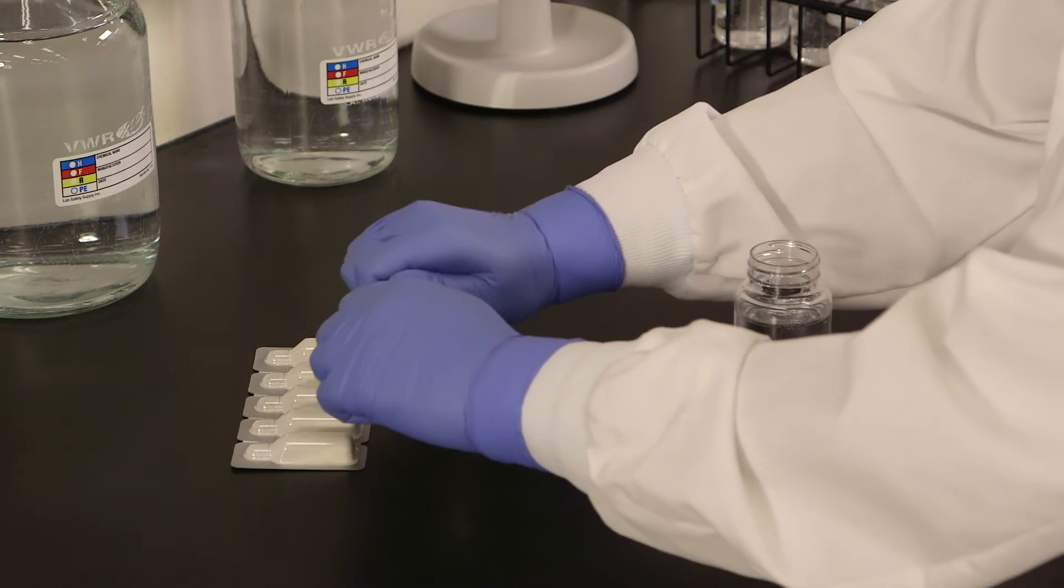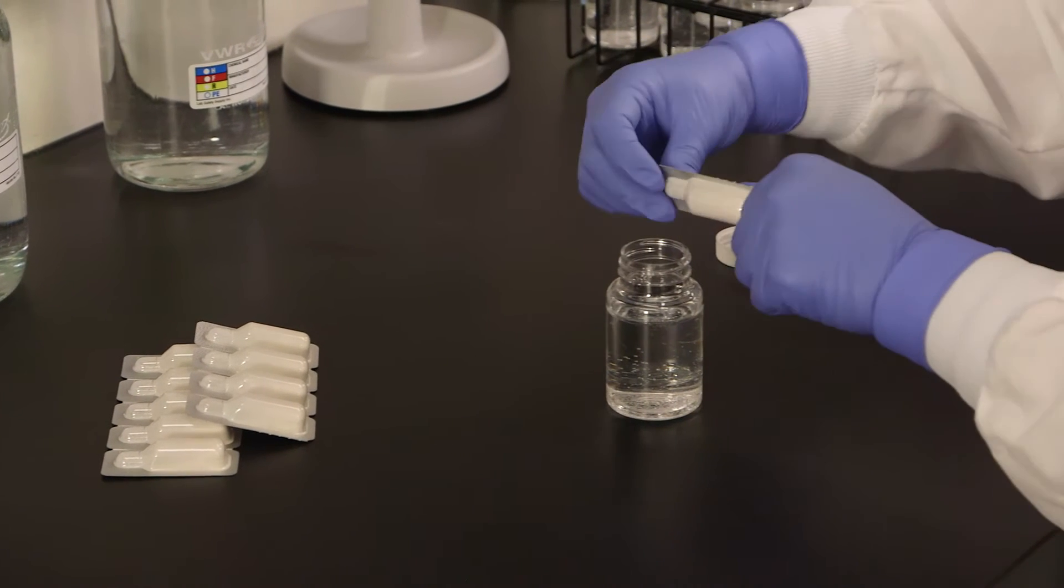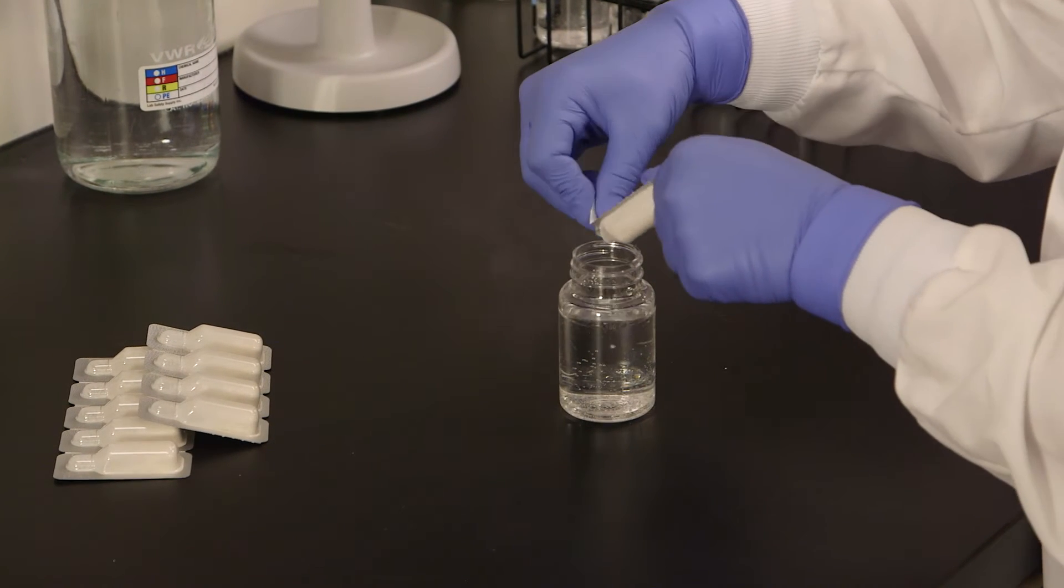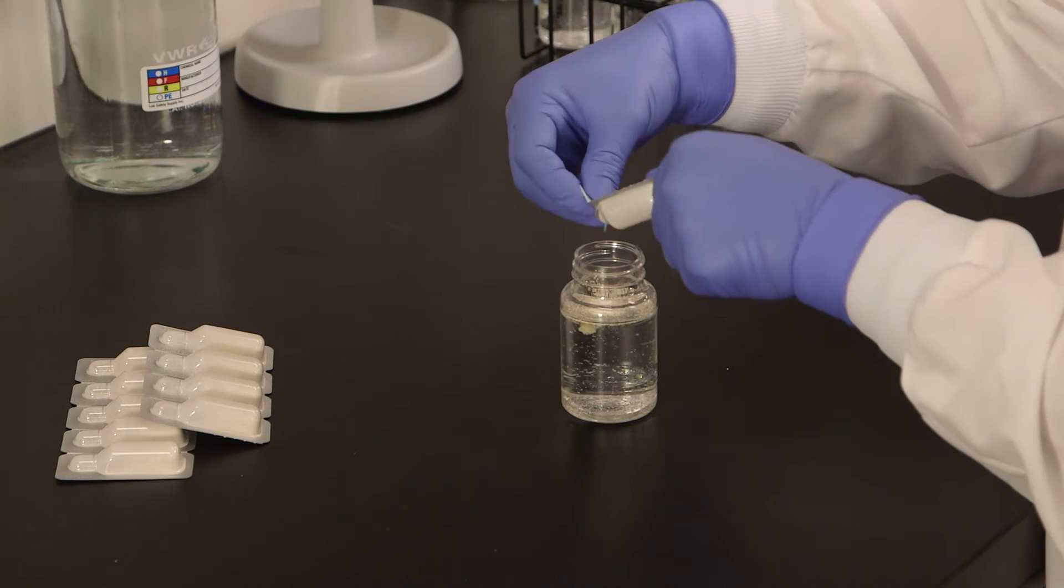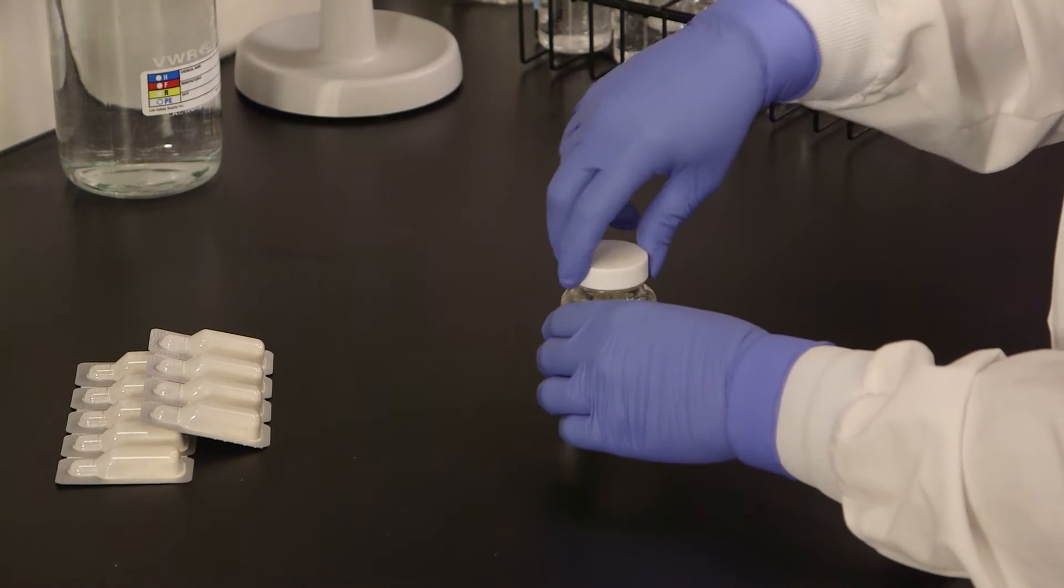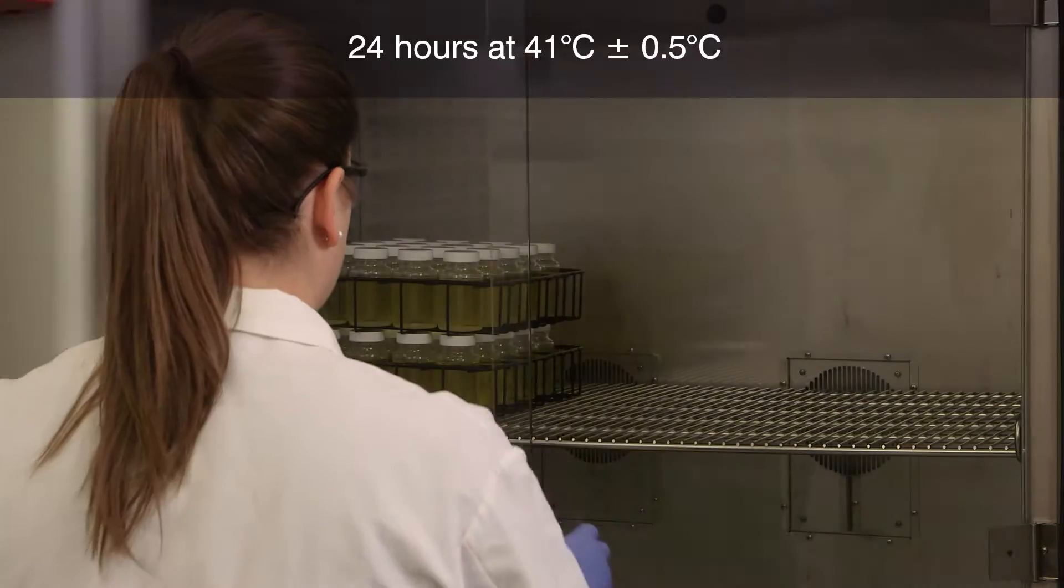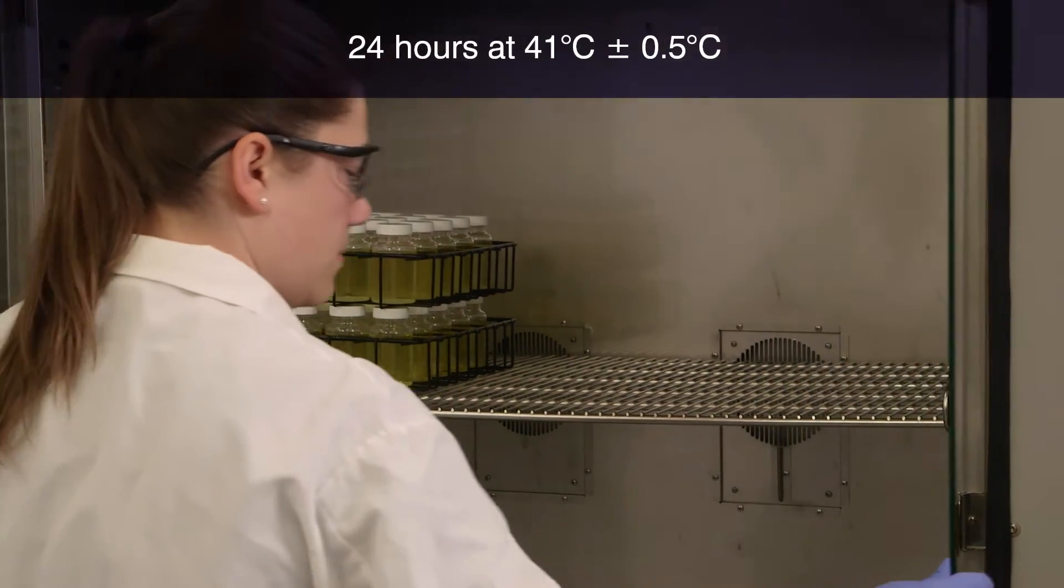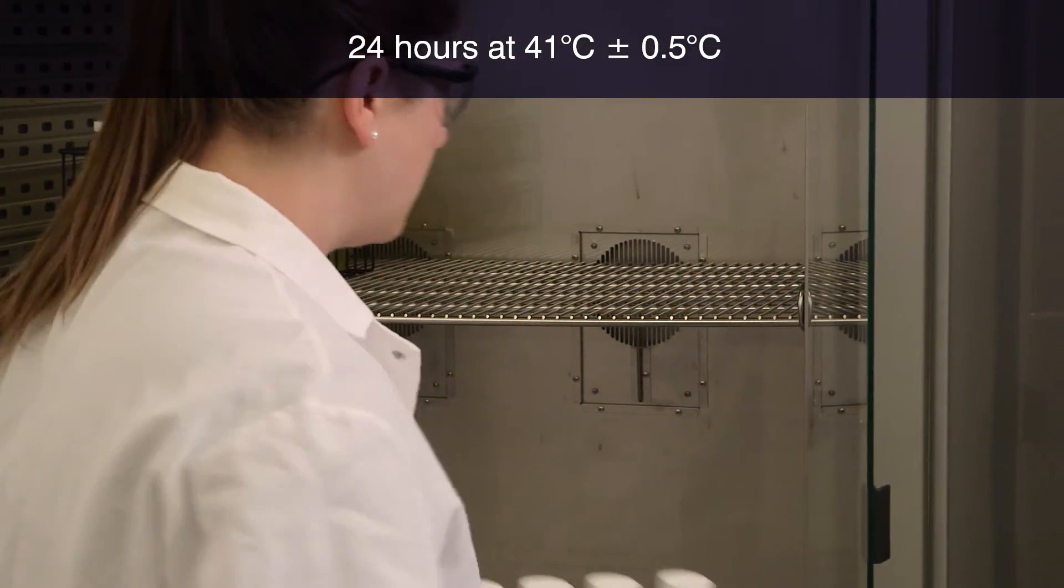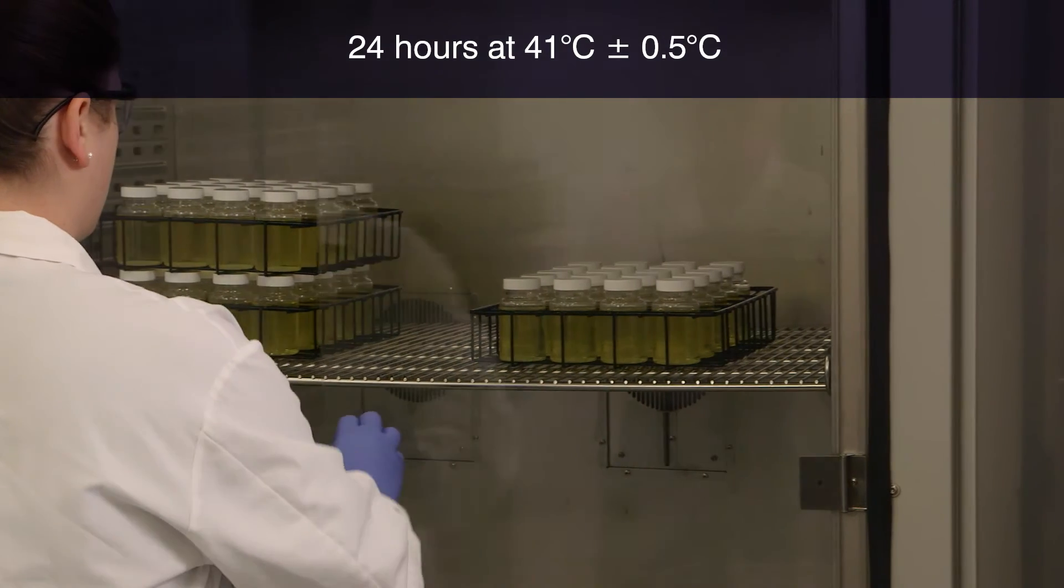Separate one reagent pack from its strip, taking care not to accidentally open the other packs. Snap open the reagent pack and pour the powder into a 100 ml water sample. Cap the vessel and shake to dissolve the Enteralert powder. Some particles may remain undissolved. Incubate for 24 hours at 41 degrees centigrade, plus or minus 0.5 degrees centigrade, or according to your local regulations.